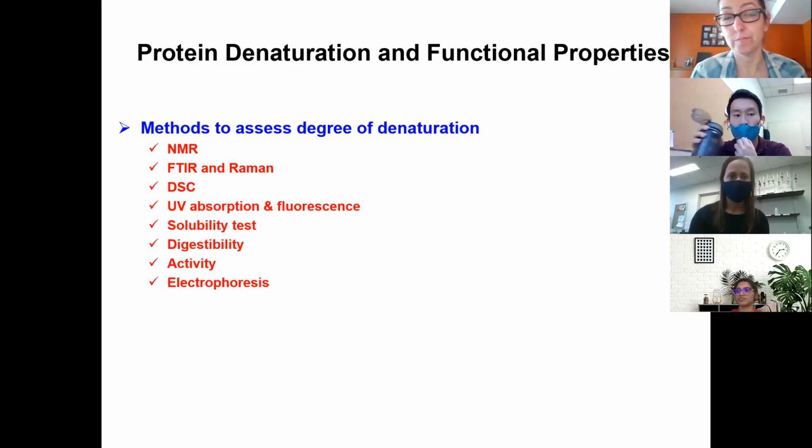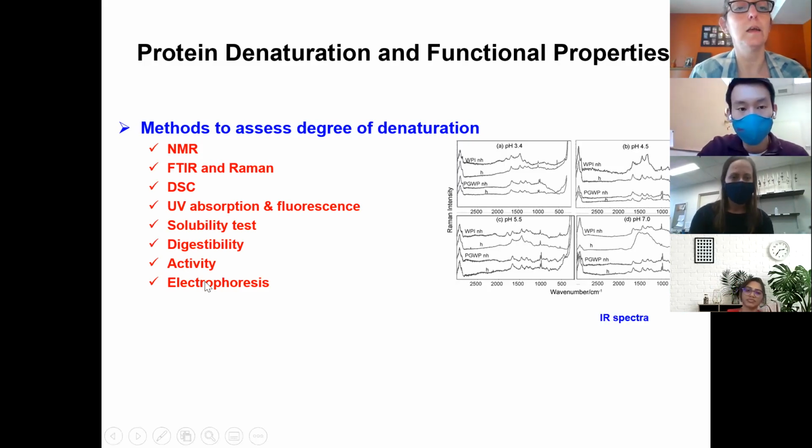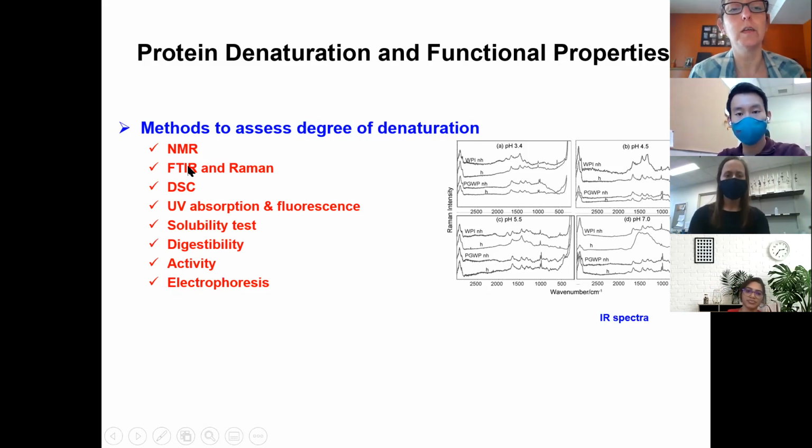All right. Here they are. So basically, we said DSC, yes. FTIR, looking at the distribution of the secondary structure. Raman spectroscopy, we talked about it also last time. In Raman spectroscopy, it shows you shifts in banding upon denaturation.